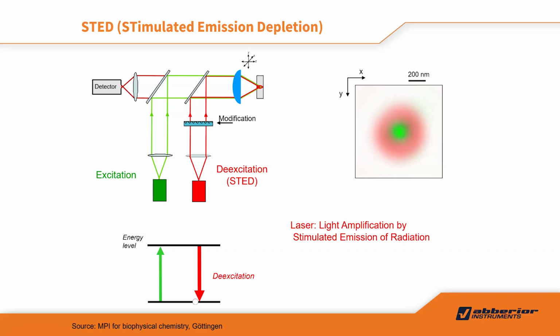So in the overlapped area, you have more and more STED photons. Then it is easy to filter the STED wavelengths by a very good filter in front of the detector, and then only allow the middle part, the donut center, where there's no STED beam. Then you have the normal confocal excitation and emission, and you have the signal spectrum of that waveform.